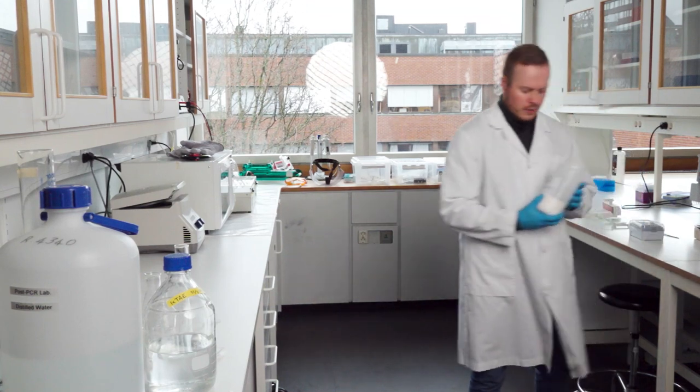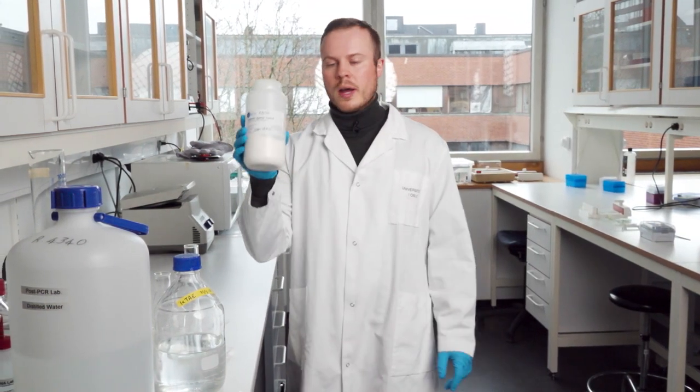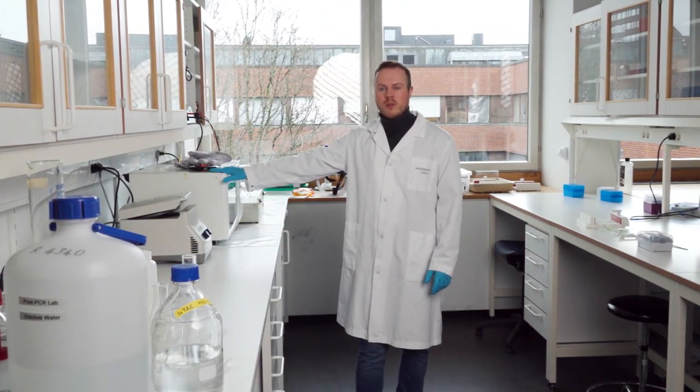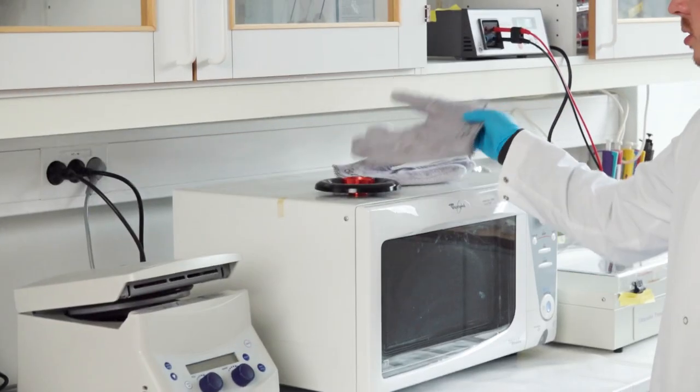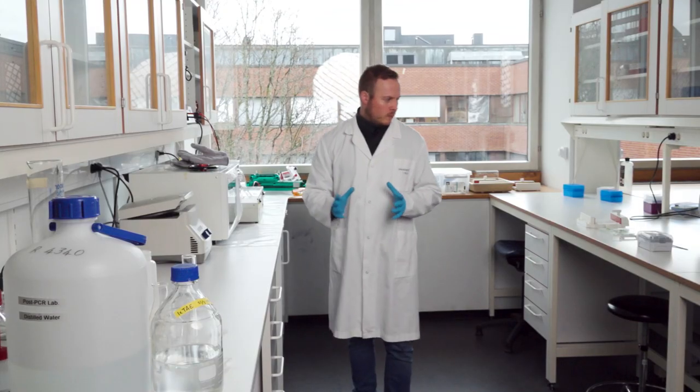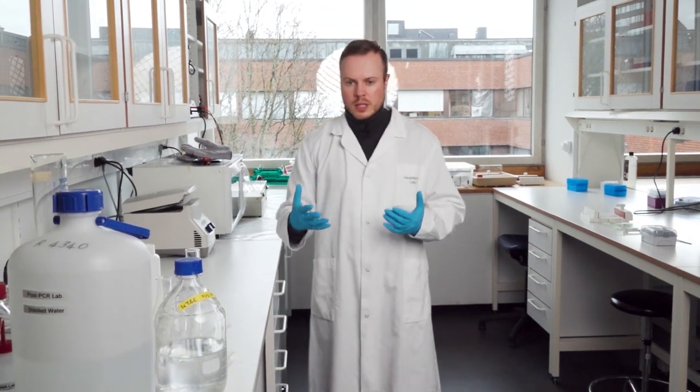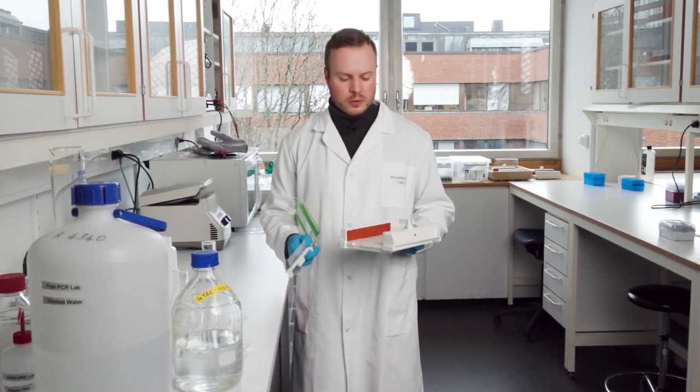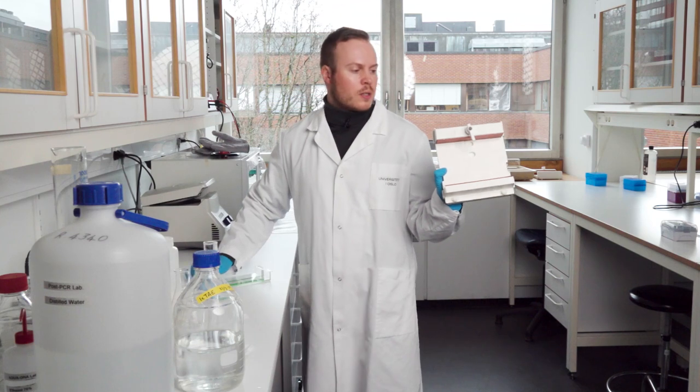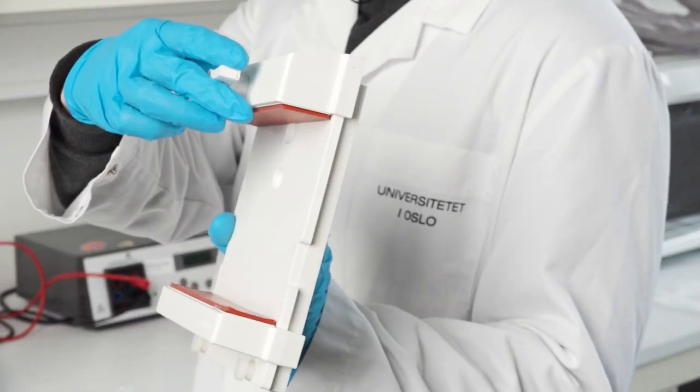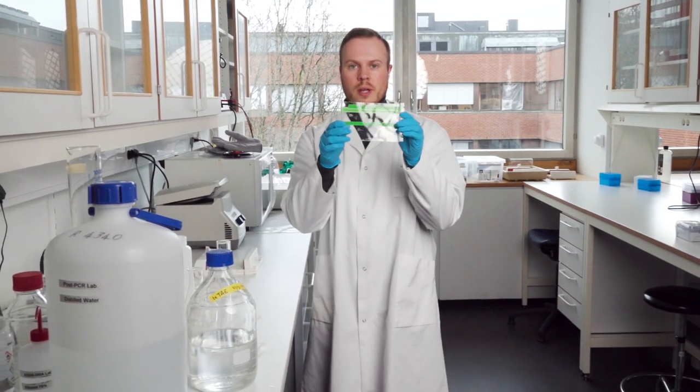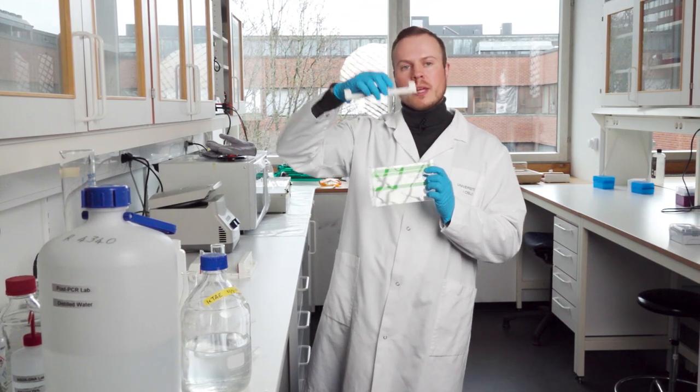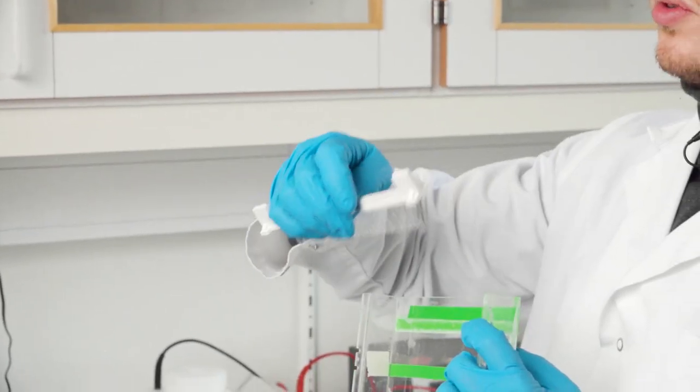We need the agarose powder, a microwave oven, and heat-resistant gloves. After making the gel, we need a mold. We use this adjustable mold with a lever and this tray with teeth. The teeth make the wells that we put the material into that we want to run through our gel.